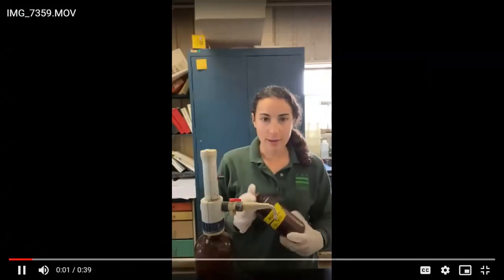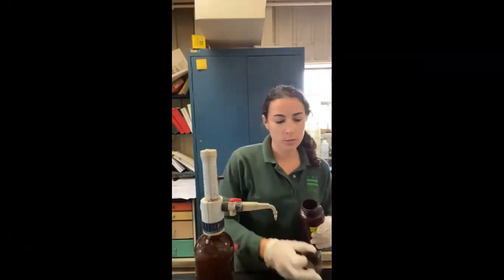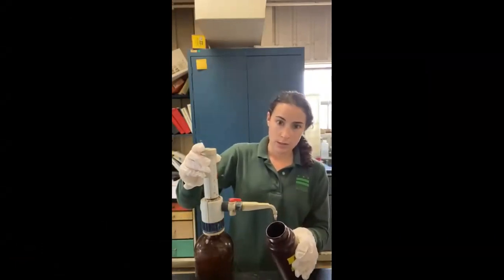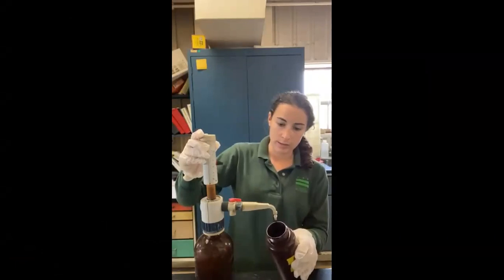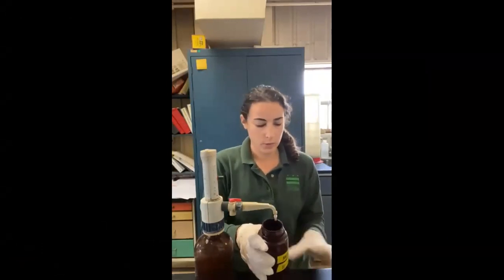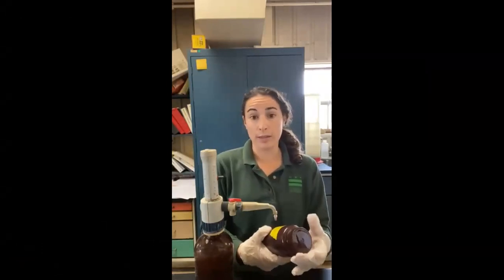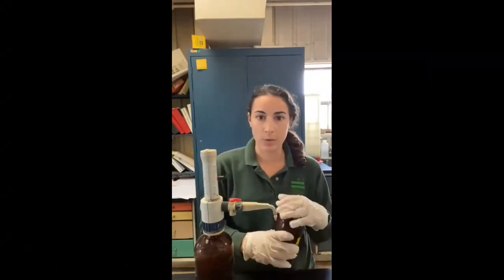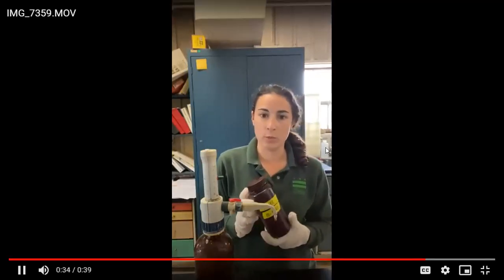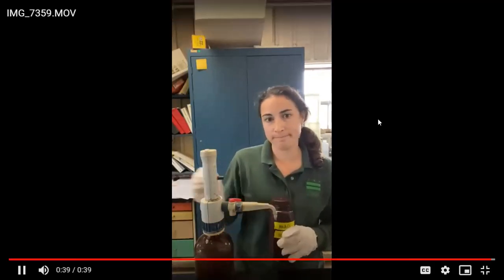All right, once you've returned to the lab with your sample collection, you want to add 5 mL of Lugol solution, which will preserve the phytoplankton for later collection. And you can see here, as it dispenses, it's this amber color. You can sort of see it. So that's how you know also when you open the bottle later in the lab to check that it has been added. You'll see that amber yellow color in the bottle. And then you want to store this at room temperature in this dark opaque bottle until future identification.